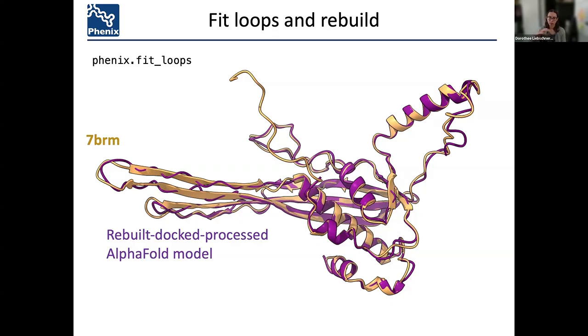Now, let's say you have a big protein with many different domains and you don't know where each should be, because this is the first instance of structure that you solve. I guess then you would have to check different regions with trial and error. Okay, so I think I caught up with the questions, so we can go further.